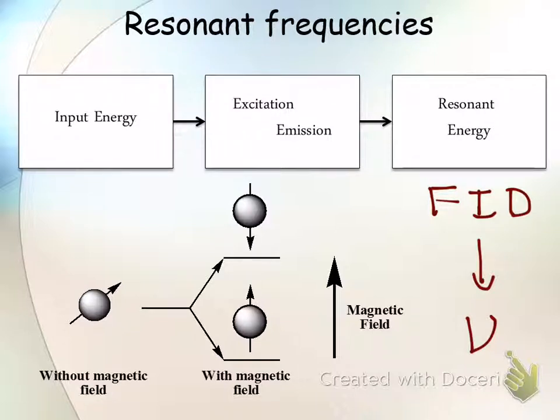The sample goes into one of these, and you have to be able to stick this exactly inside the magnetic field so that the solution that's in your tube, your sample, like your product or reactant, testing the NMR spectrum, gets in there. So the way we do that is we have this device. That's to hold it in place. And then we have a gauge. And this sits on the NMR at all times. If it leaves the NMR, it'll break your fingers. No, I won't. But I'll cry. Because this is like the only one of these we have.